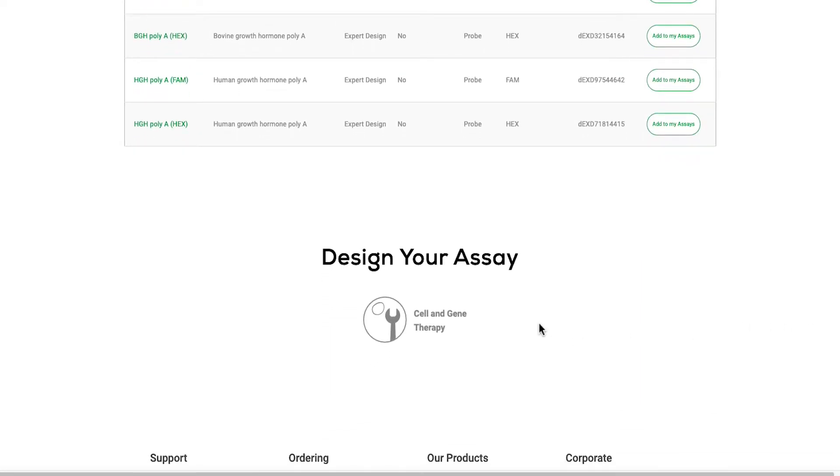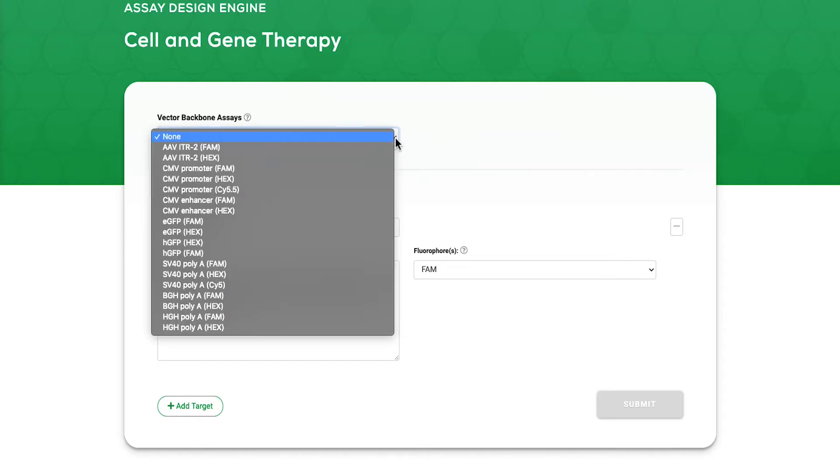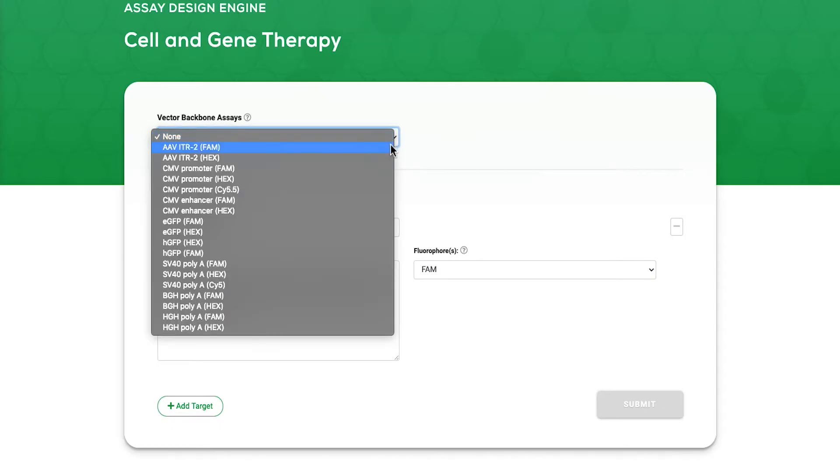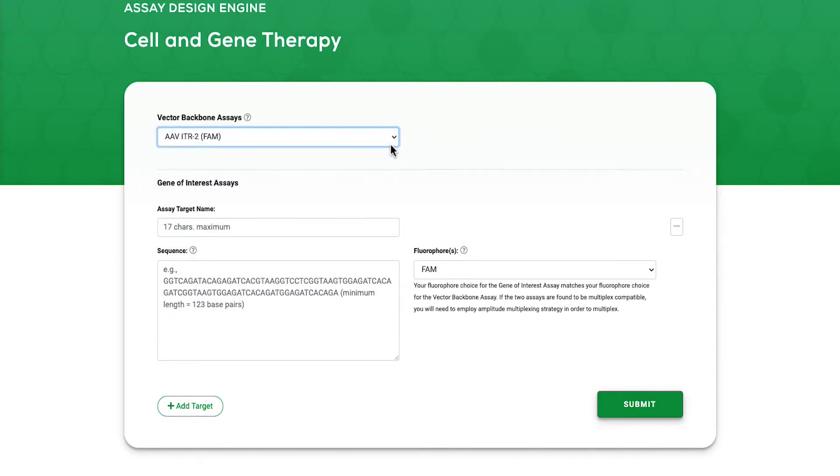For custom gene of interest assays, the cell and gene therapy design engine allows you to quickly design and order highly optimized DDPCR assays based on your target sequence.